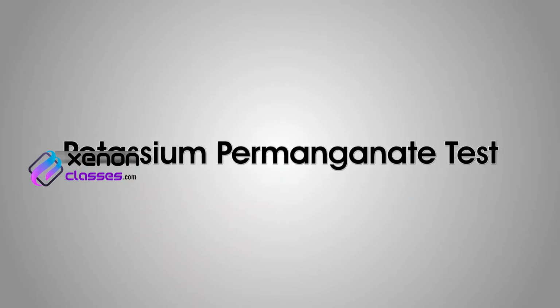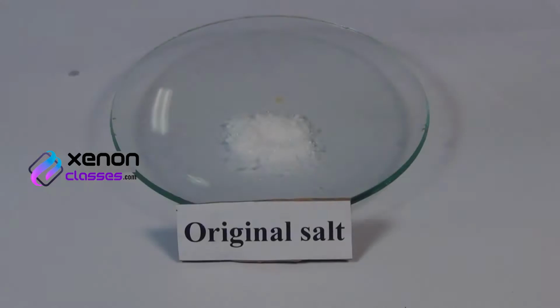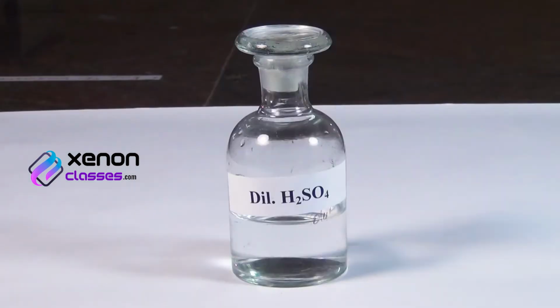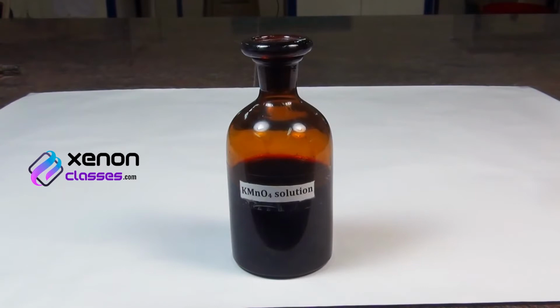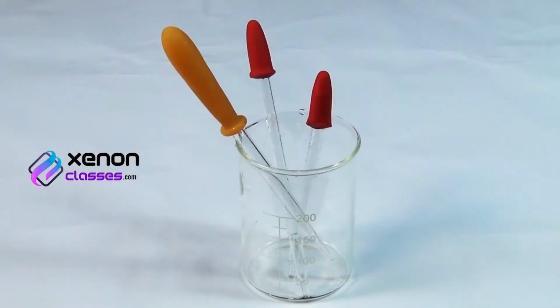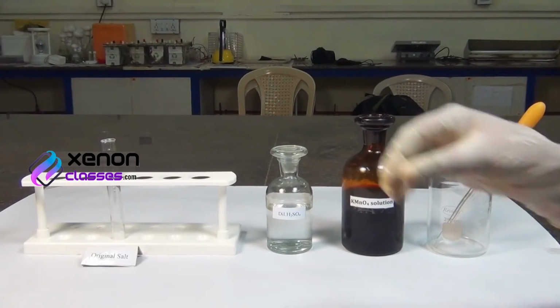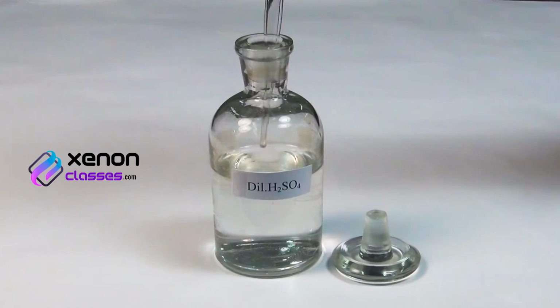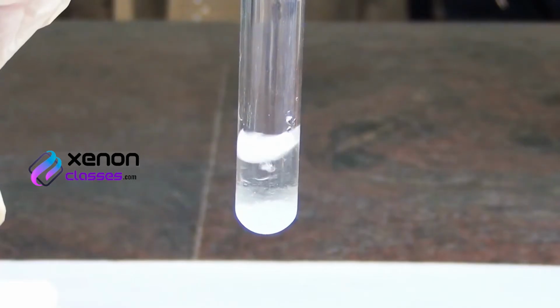Potassium permanganate test. Materials required: original salt, dilute sulfuric acid, potassium permanganate solution, test tube holder, droppers, and a Bunsen burner. Procedure: take a small amount of the salt in the test tube. To this, add a small volume of dilute sulfuric acid using a dropper.